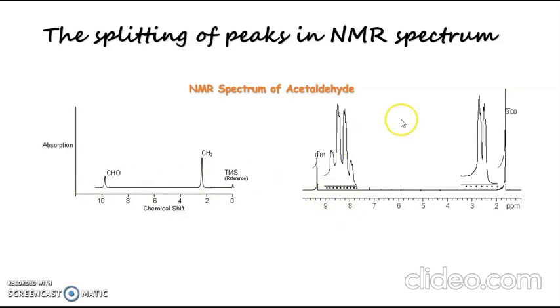And then, the second spectrum, for a single peak, is here. The peaks are split into different signals or multiplets. In this spectrum, we have considered only the points we have discussed, that is, the number of peaks depends on different non-equivalent protons, and then the position of peaks.